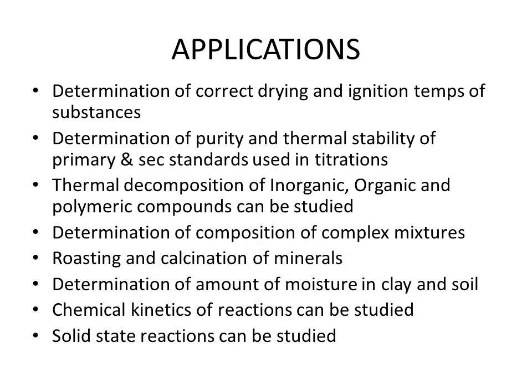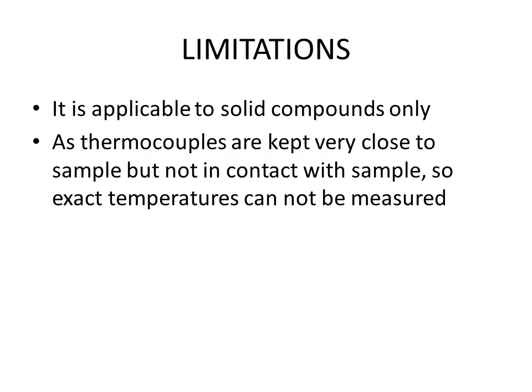So these processes can be studied with this technique. We can determine the amount of moisture in clay and soil, so it is quite clear. We can study the chemical kinetics of reactions, meaning we can find the rate of reactions, and we can study the energy of activation through this process, and we can study solid state reactions through TGA.